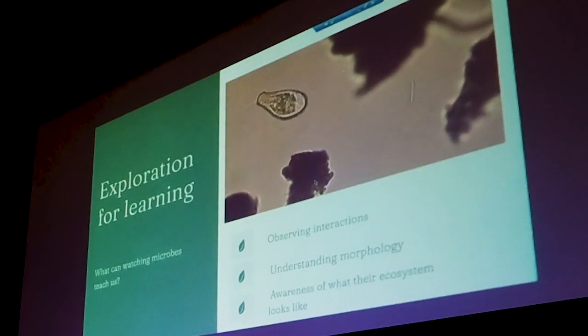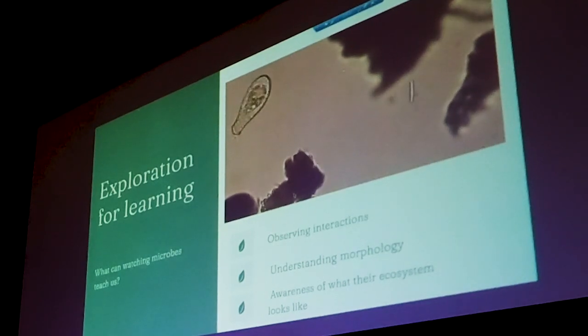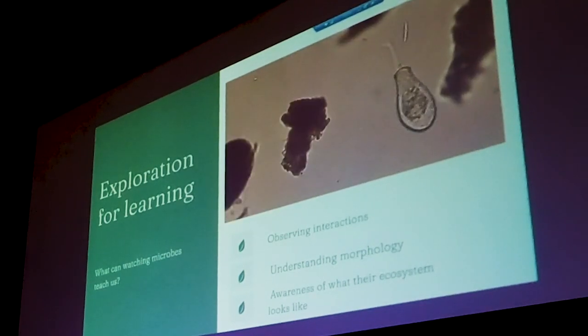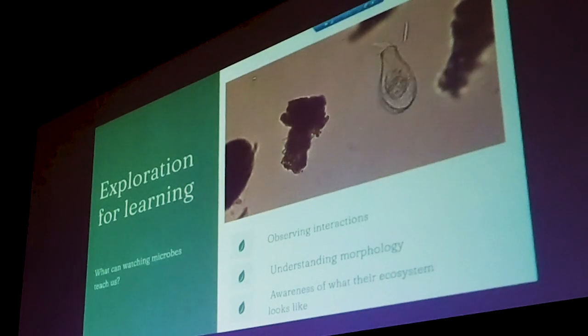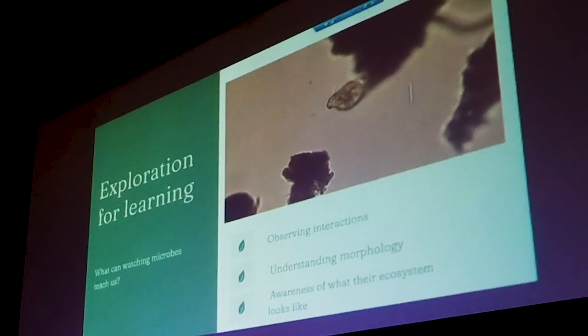And so, the big thing is, when we're trying to understand what we're looking at, we're just observing interactions. We're using the morphology, what the microbe looks like, right? I know this is an amoeba. I can see its pseudopods. I can see its test, which is its shell. It actually builds that shell with those pseudopods, by the way. It reaches out into the solution, it grabs silica, and it literally builds that test, which is incredible.